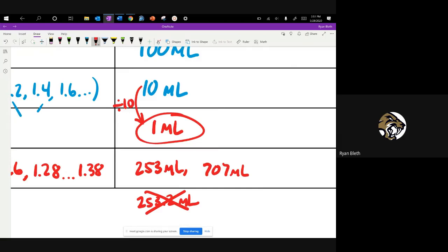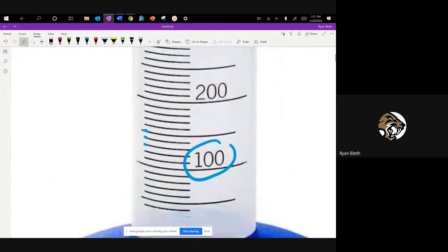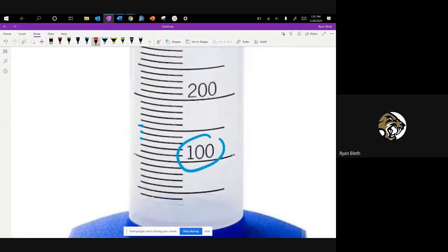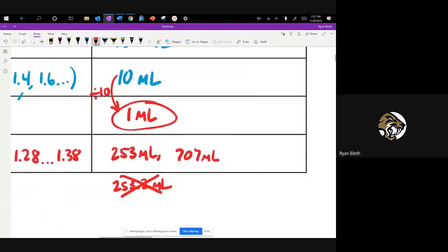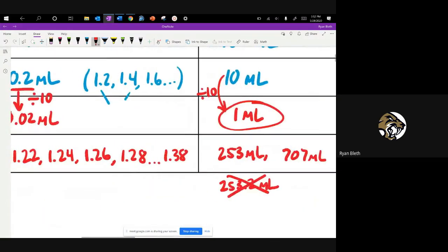The device can only be as precise as this estimated limit. Since the smallest labeled lines are to the nearest ten, you can estimate ten times finer than that — down to the nearest milliliter. But you can't go down to the nearest tenth of a milliliter. That would be like taking the space between two markings on this graduated cylinder and imagining 100 small lines between them. It's just not possible — the finest resolution your eyes are allowed to have is dividing that space into ten smaller spaces. So 253.2 would be too precise for our readings here.